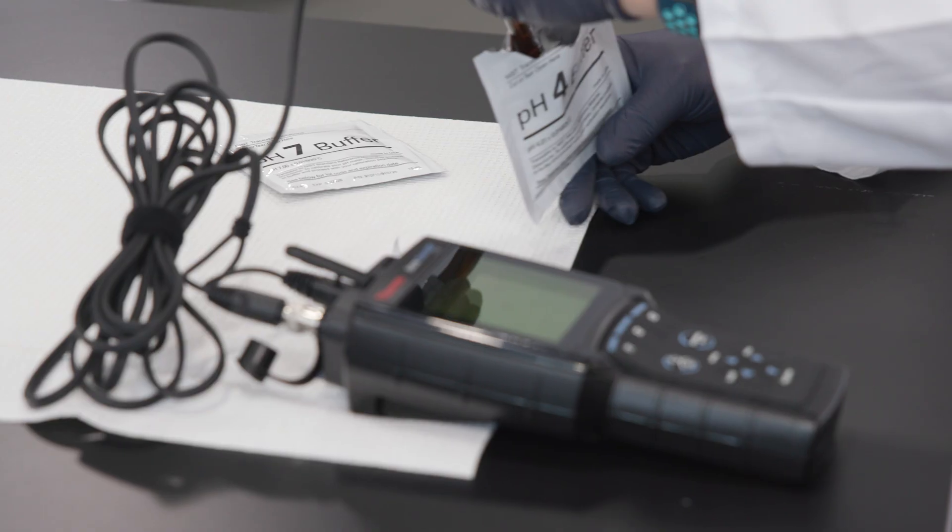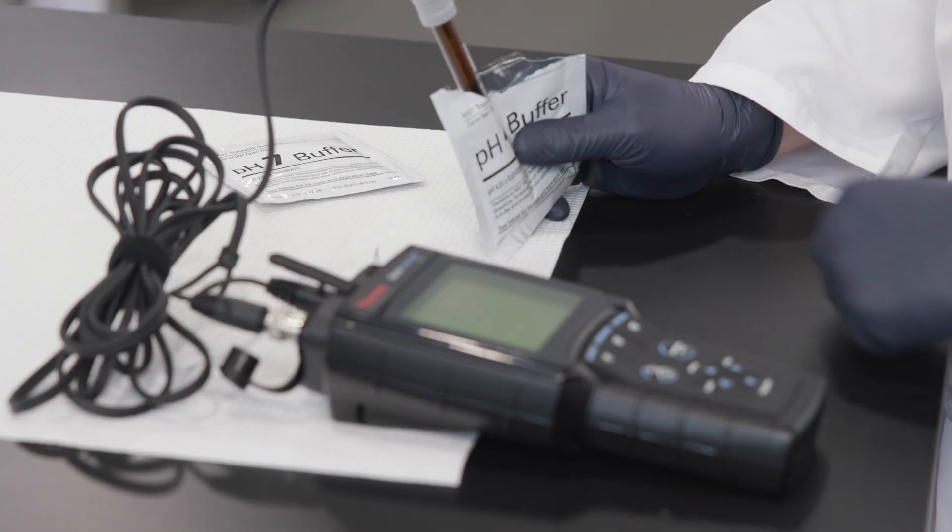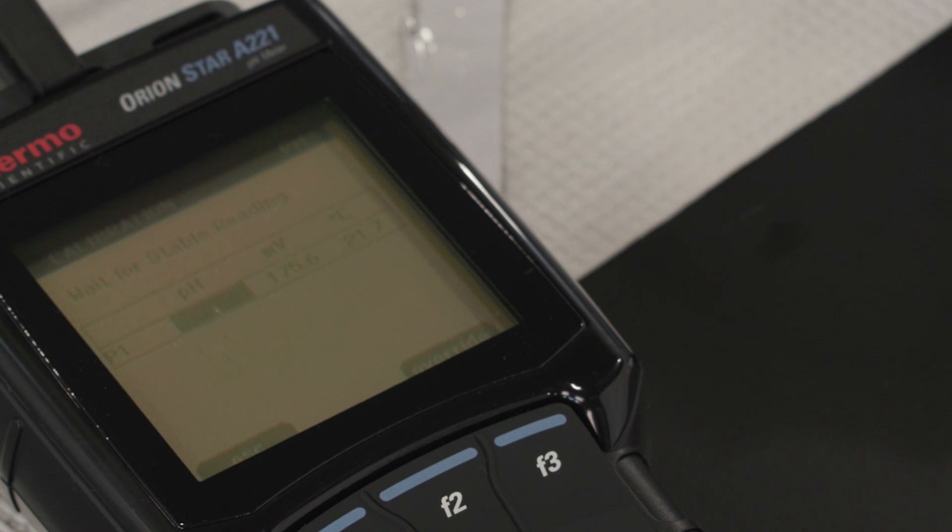Automatic buffer recognition helps simplify calibration and improves accuracy by assigning the correct pH value for the buffer at the measured temperature.